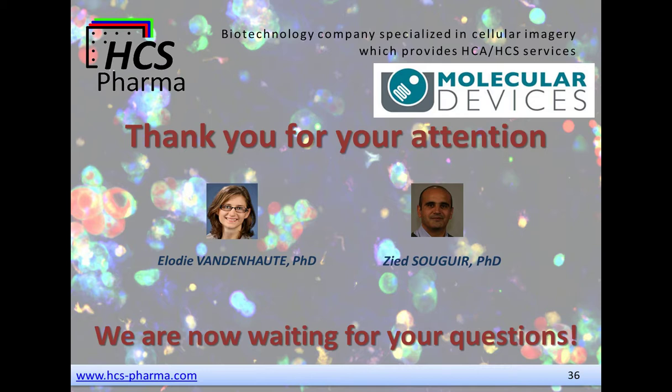I was a little confused on the exact intent of the question. Great, thank you, Dan. Okay, next question. Wow, we're getting so many great questions. What is the cost for a 96 well plate? There is a difference between the different matrices in terms of composition, but it's between 200 and 300 euros per plate.